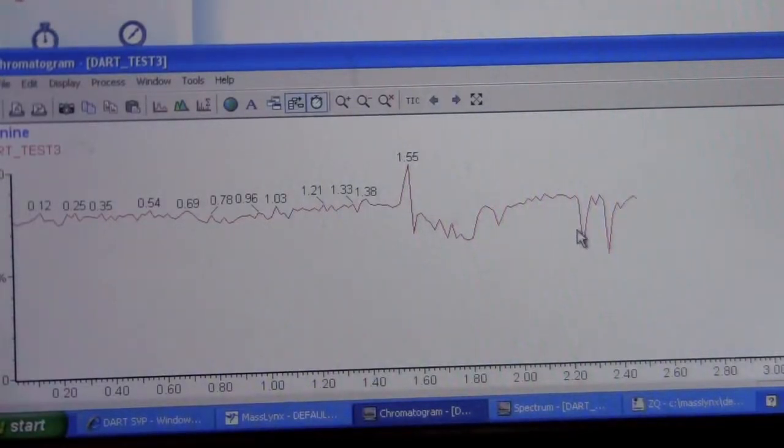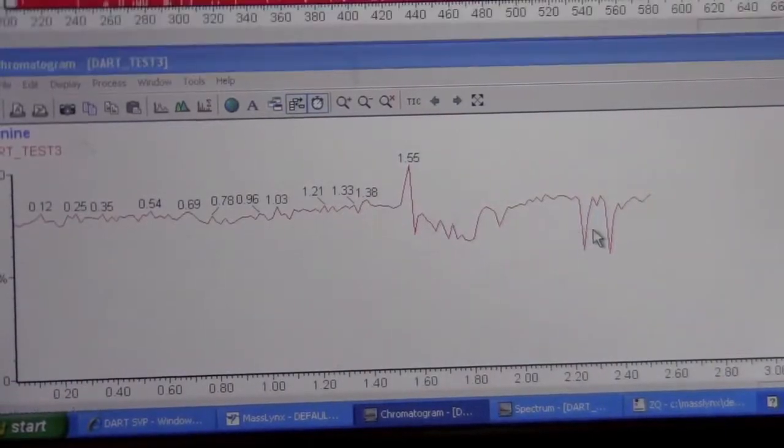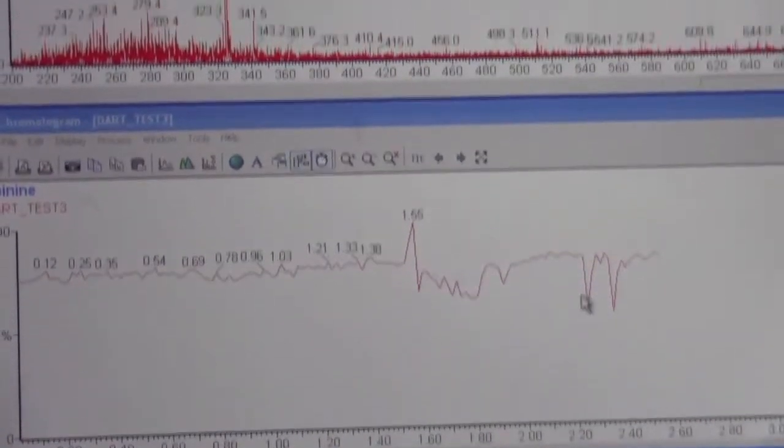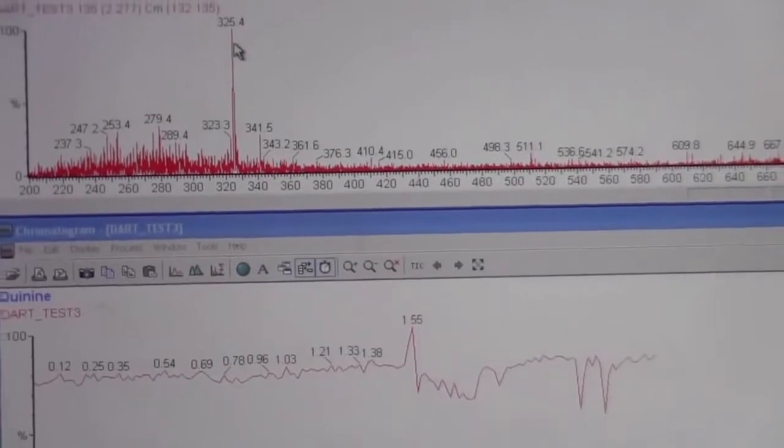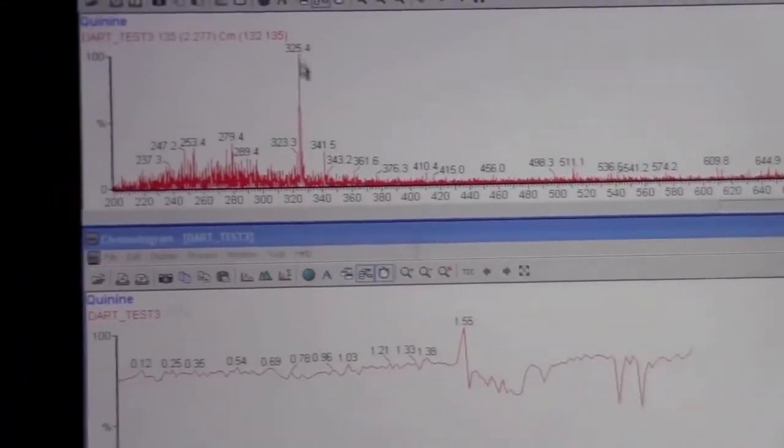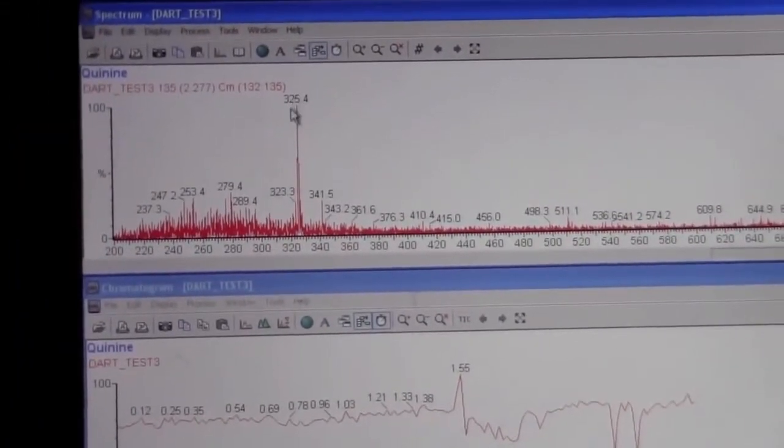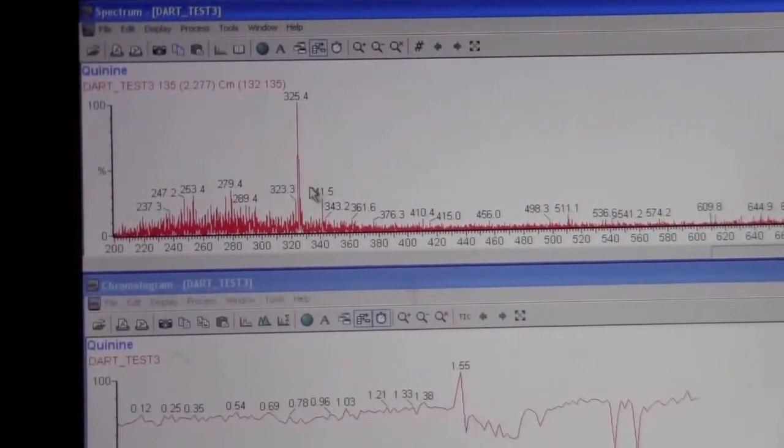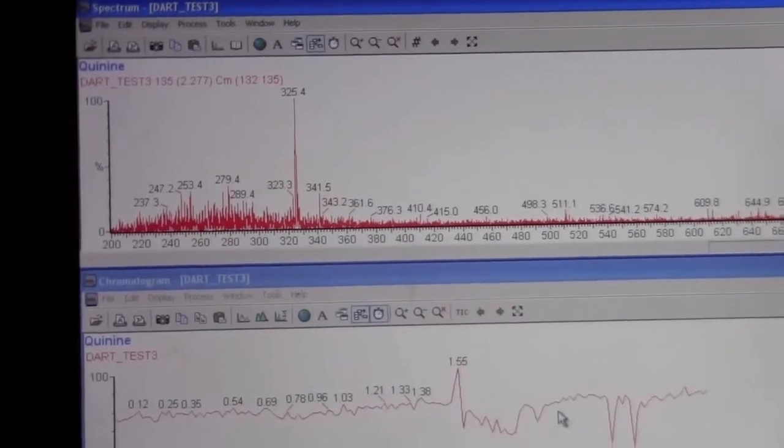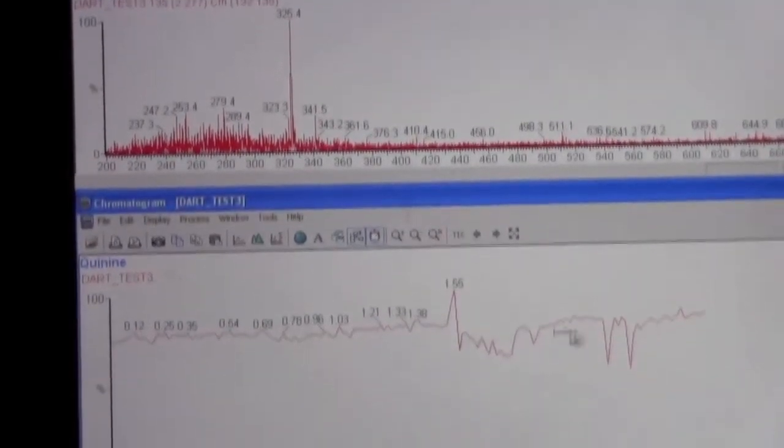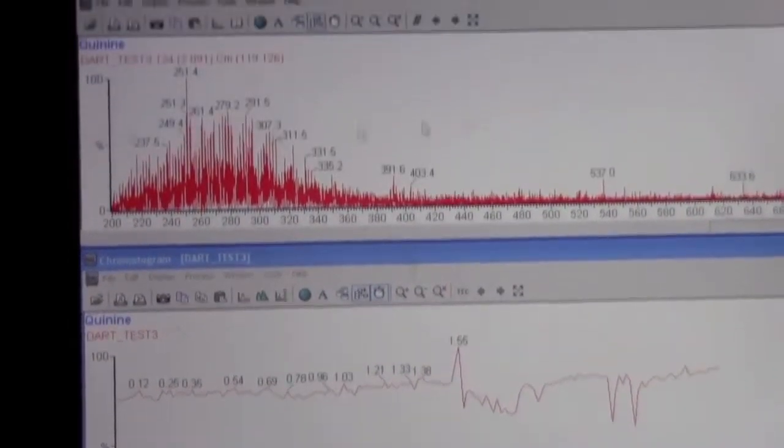So if we right-click and drag on the dip, we should be able to see the mass spectrum. And this is the mass of the sample that we put in here. If we click another region, we will just get noise.